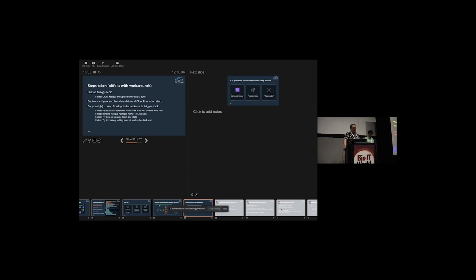And then there's no way to delete reference sequences from the console. The only way you can delete them is through AWS CLI, and the one AWS CLI that I installed using Homebrew didn't know anything about Omics yet. So I had to use Homebrew to delete AWS CLI and then download the package installer that they provide. And then, it's a little bit tricky, a couple of commands to delete the reference store, but I was able to delete them. I went to run it again.